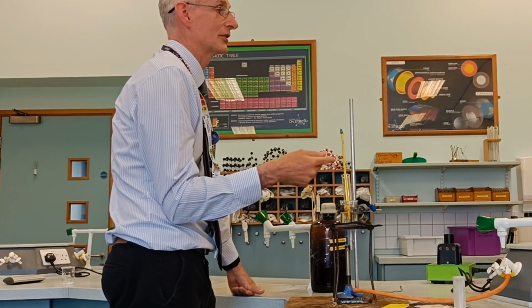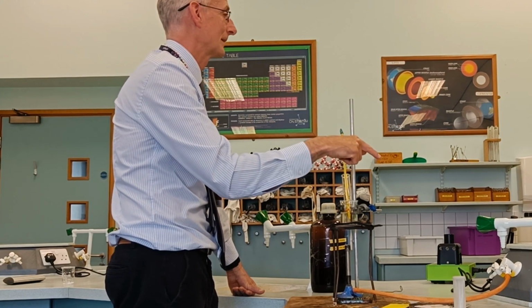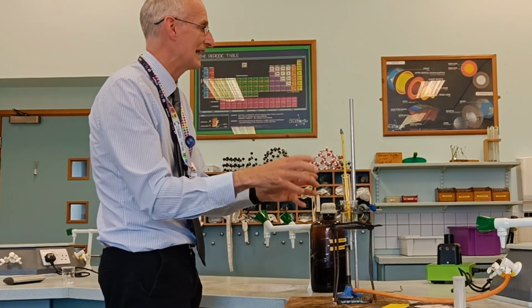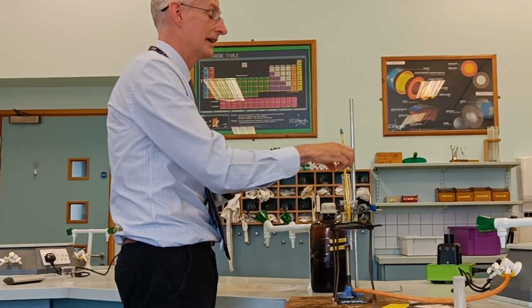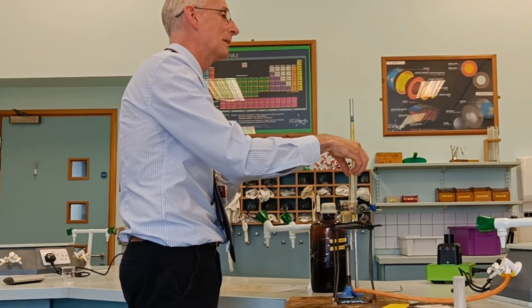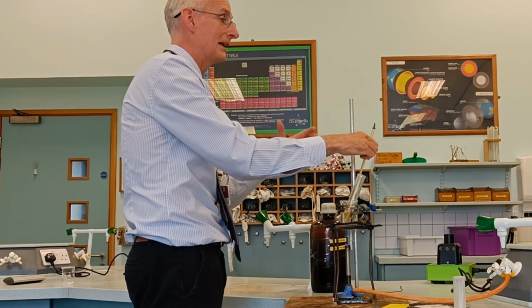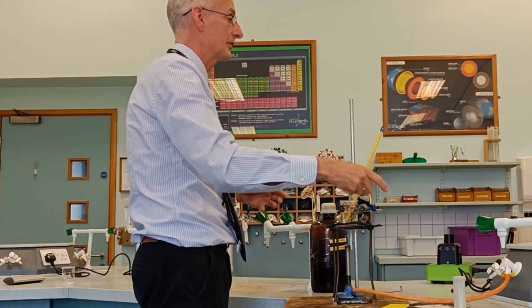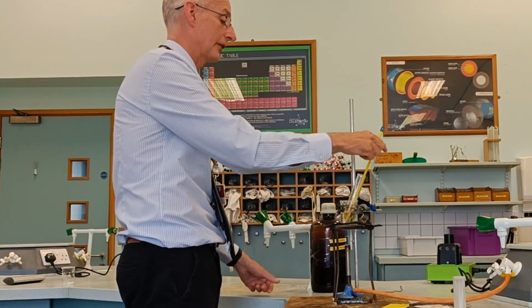What I often do is when it gets to like 5 degrees below the target temperature, I'll turn the Bunsen off. Okay, because the residual heat in the outer oil bath is going to come through and heat up the inner one. So the inner one lags behind the outer one. So when this thermometer here is reading about 115, I can turn the Bunsen off, yeah, and just let the temperature rise a little bit.